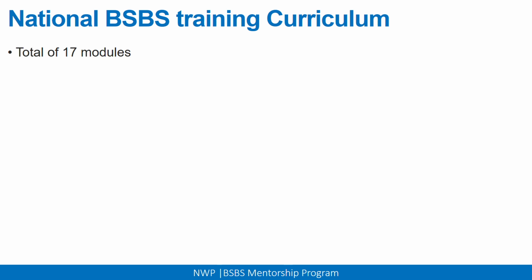So here we're just going to look at the different modules that are in the National Biosafety Biosecurity Training Program. Then maybe we'll see how best you can use these modules or materials to enhance your facility biosafety biosecurity training program.